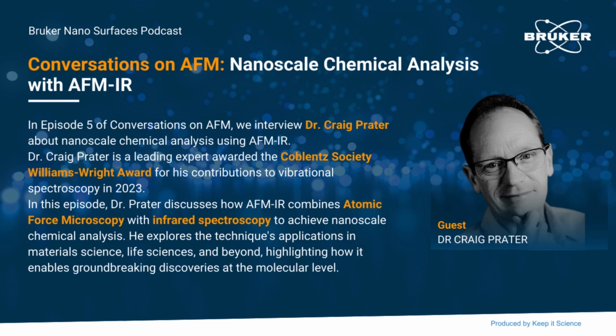For an extended period during the development and use of AFM, there was a very common challenge where AFM really excelled at achieving very high spatial resolution, making beautiful images of a wide variety of samples. But one of the most common questions is we would look at an AFM image of a sample and we would see some interesting structure. We would go, well, what is that? And the AFM was not very good at answering the question of what is that?